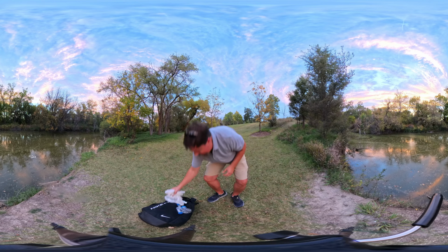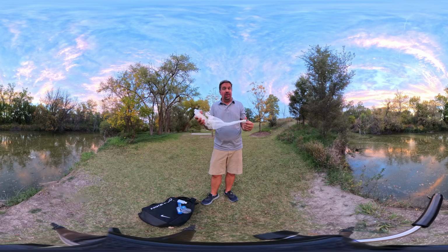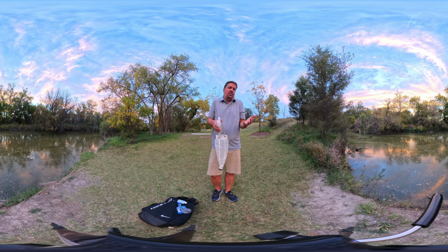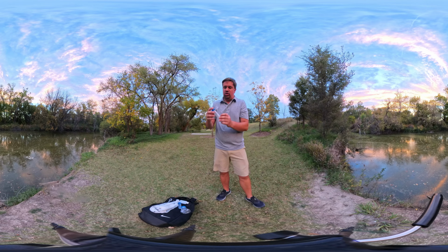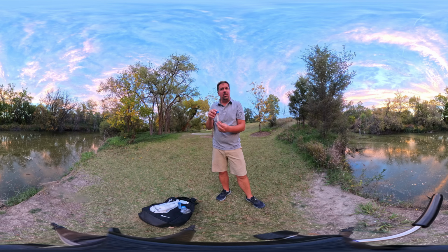You see, what I have here are algae nets that we'll use in just a moment in order to collect some of these surface organisms. Again, we don't really know if they are cyanobacteria or not. So we're going to collect them, and then we're going to store them temporarily in these Falcon tubes. I've pre-labeled a few of them already.